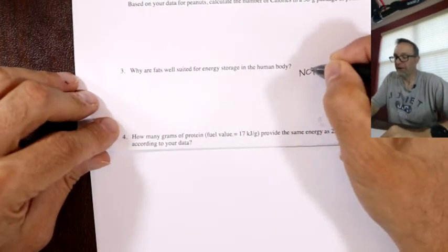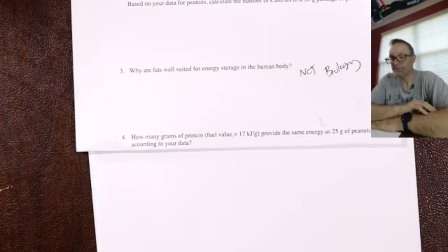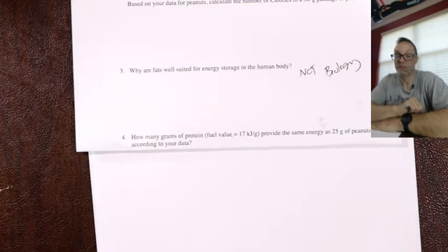I'm going to write not biology. So some of those nuts and other foods on there have higher fat than others, and you can kind of use your common sense to figure out which, right? Okay. So based on the results for this experiment, those kilojoules per gram numbers, think about which foods have the highest fat, how that relates to kilojoules per gram, and then tell me why fats are well suited to storage in the human body based on the results from this experiment.